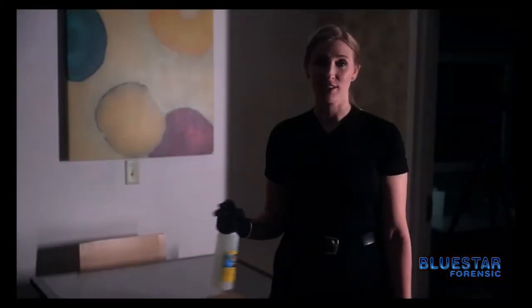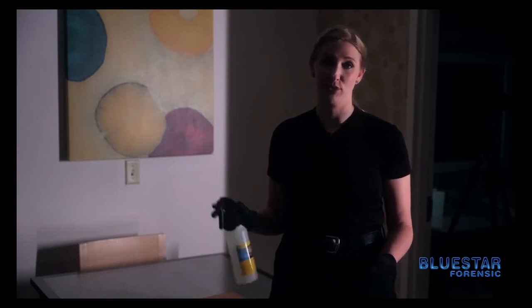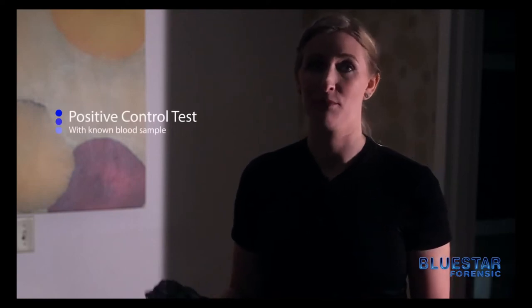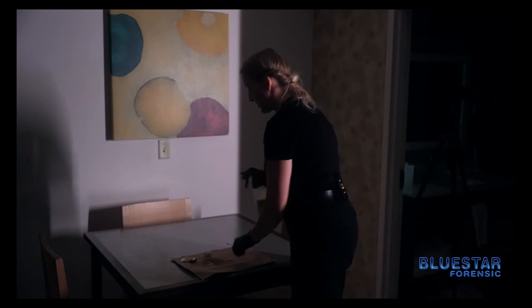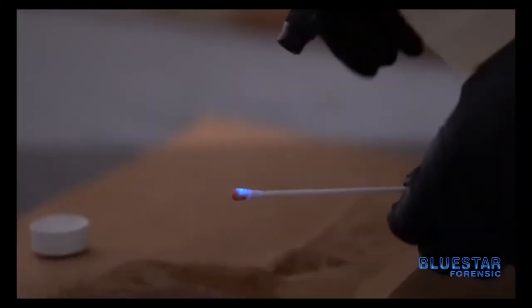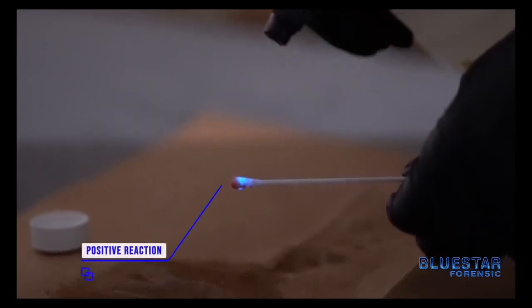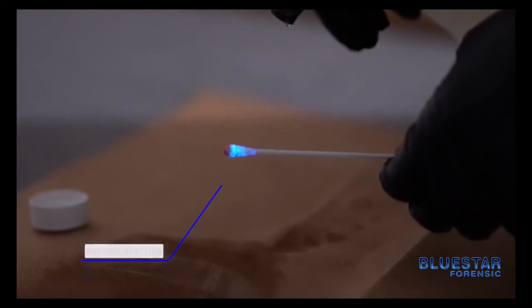Before using any product on a crime scene you want to make sure that the chemical is working the way it's supposed to. So in order to do that, we're going to use a known blood sample to make sure the chemical is working properly. We'll also dim the lights a little bit so that we can see the reaction. As you can see, the chemical is reacting the way it's designed to — you see a blue glow from the known blood sample.